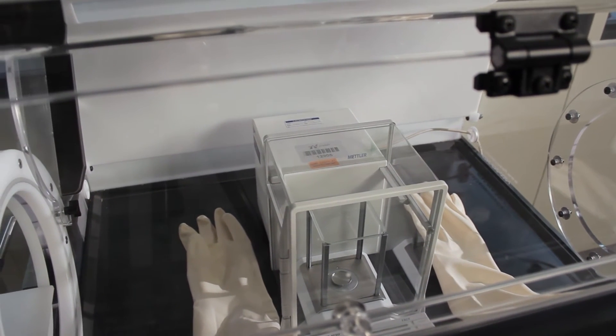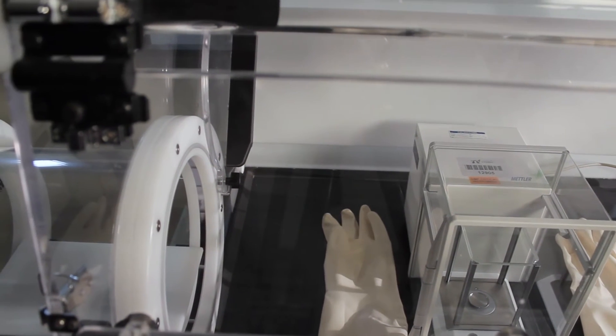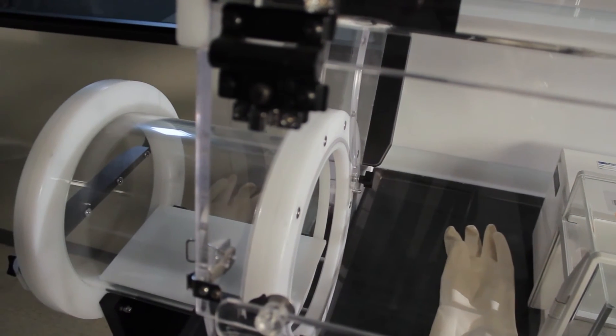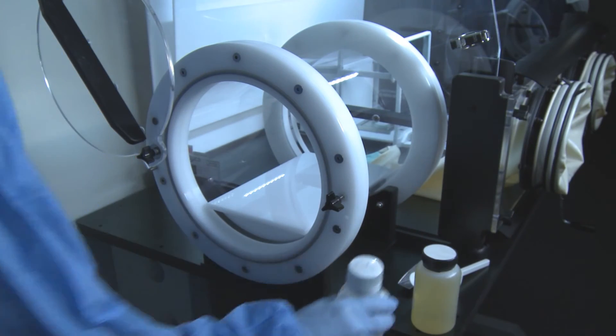This particular unit allows the operator to control the interior atmosphere via inlet and purge valves located on the top and side of the unit. Hinged, sealed doors secure the environment, ensuring its stability.